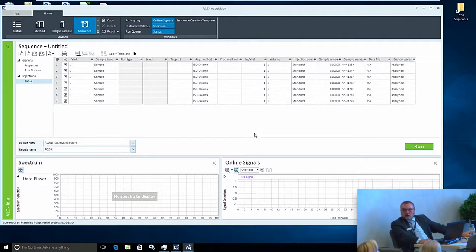Is there anyone having a LIMS system from where you get sampling information for a sequence?